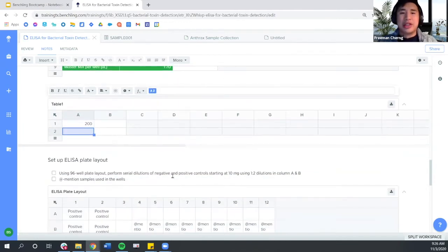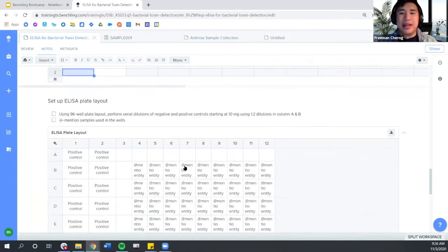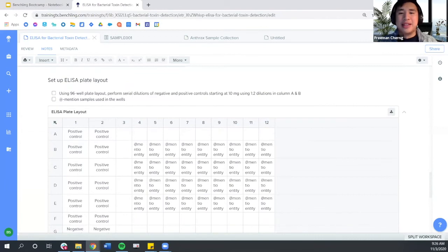Another type of unstructured table in Benchling is a plate layout. So from my lab days, I would do the NADH glow assay with 2 96 well plates, with each well containing a different bacterial culture. I distinctly remember not only having to write down each sample that I used in my lab notebook, but also having to physically draw a sketch of the plate and map the components of each cell after the assay is finished. But with the Benchling plate, I can solve both of these time-consuming and error-prone actions at once.